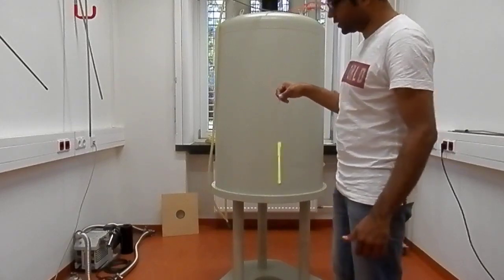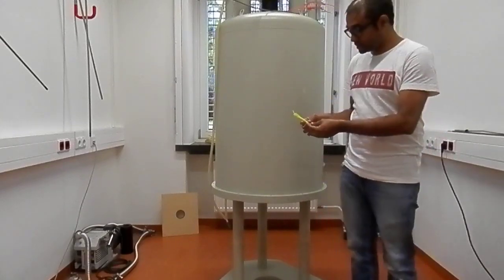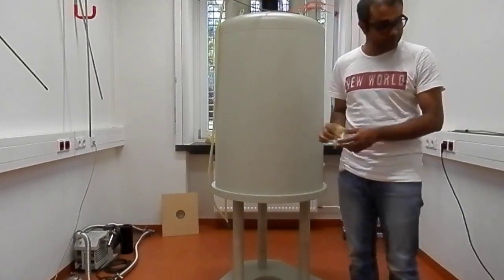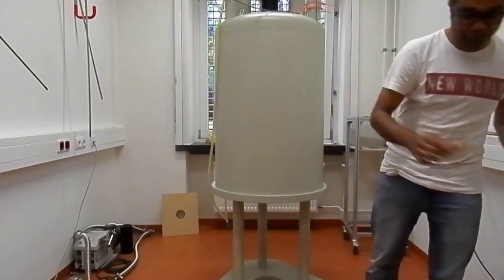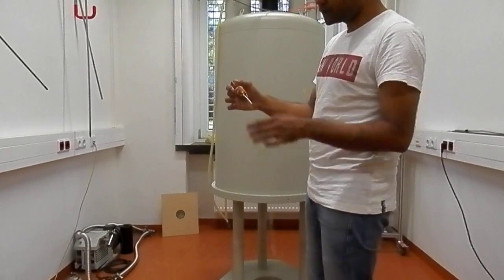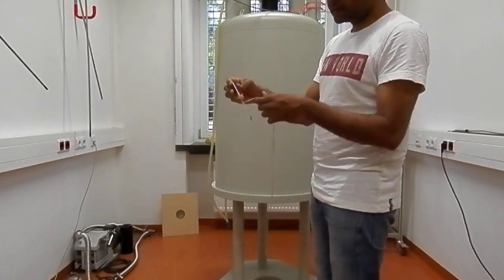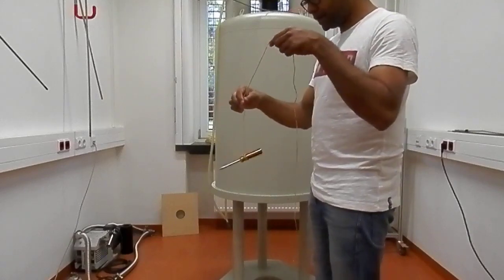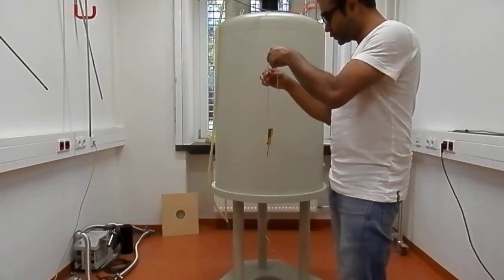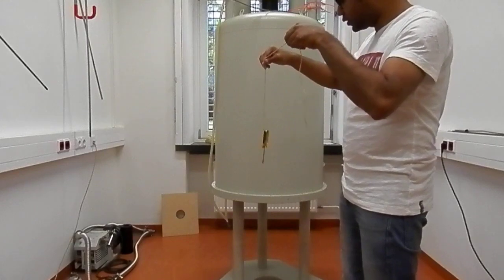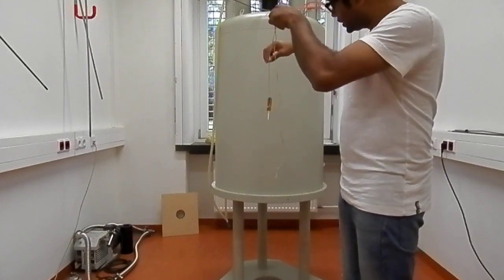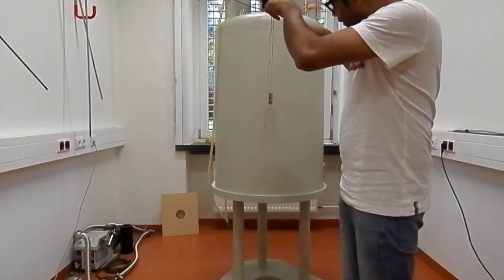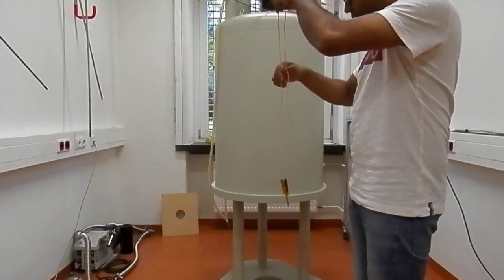Now let me place this screwdriver, which has magnetic material inside, and let's see if I bring this screwdriver close to the magnet how it behaves. You see, immediately the magnet attracts it very strongly.